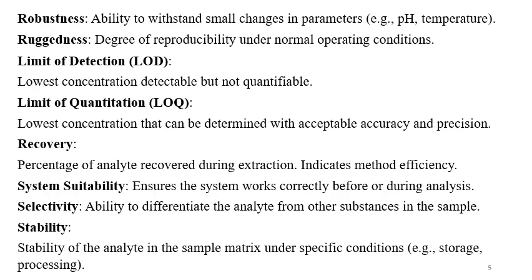Some parameters are tested in the validation, and validation is performed on these parameters: robustness, ruggedness, LOD, LOQ, recovery, system suitability, selectivity, stability, intraday, interday. Many parameters are there. We will see those parameters one by one. So robustness. The method should be robust.